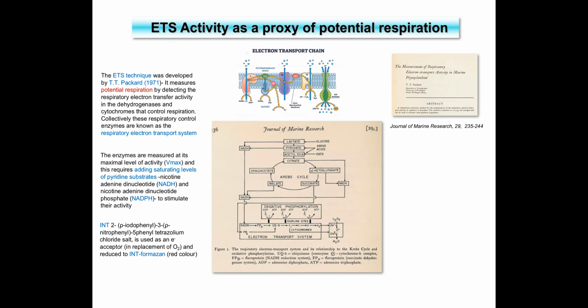In the last years, we have to say there have been some changes in terms of reducing the amount of water that you have to filter. I remember when I started, I filtered more than 20 liters of water. At this depth in the deep ocean, we are now filtering like 8 liters. So you can concentrate your samples. You can also do continuous kinetic measurements. So there are some variations that have improved the methodology, but basically it is the same.